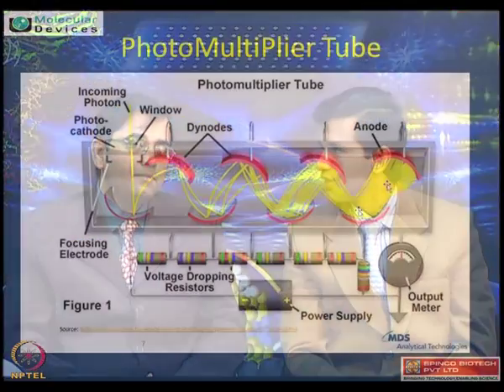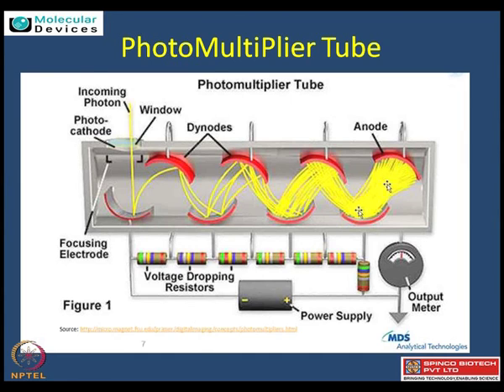Yes, essentially because the signals are not all present at the same level. The data could be right from 0 intensity, which will be equivalent to the background, to the very highest intensity. The best way to control the variations is by looking at the photomultiplier tube. Once you do fluorescence, the intensity comes out of that. So the very low expressing genes or proteins will give you very low fluorescence intensity, whereas the high ones will give very high.